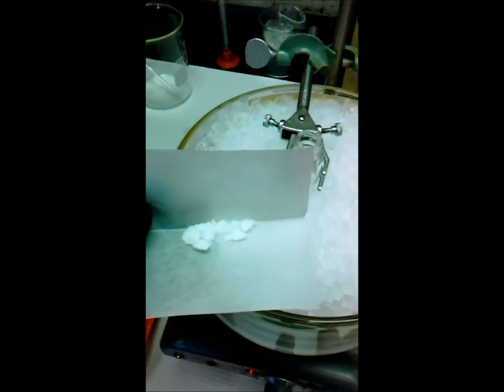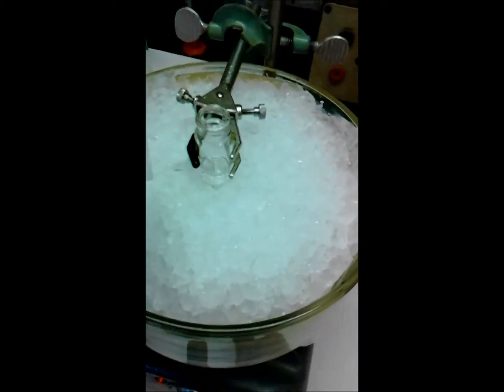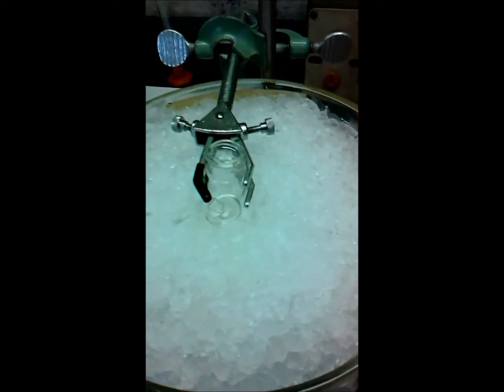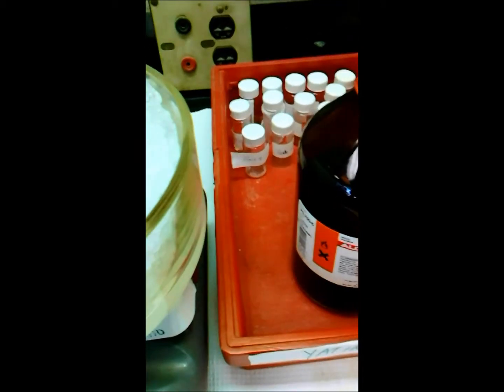Alright, so we have half a gram of our recrystallized Meldrum's acid, 2 mL of dry DCM in there. So the first step will be to add this. So the Meldrum's acid is dissolved now. We're going to be adding a catalytic amount of pyridine.